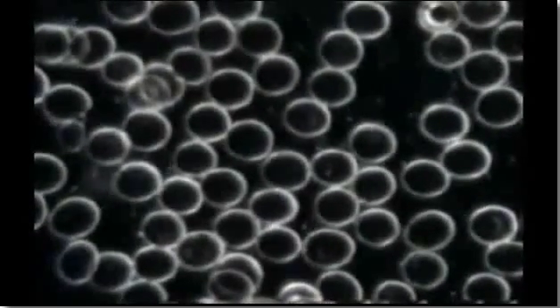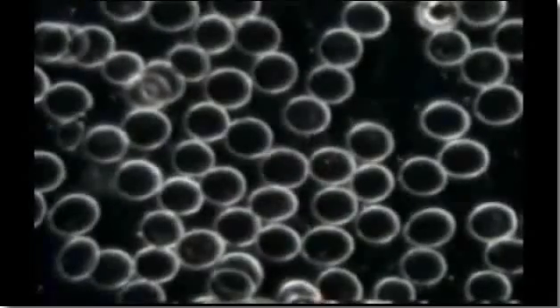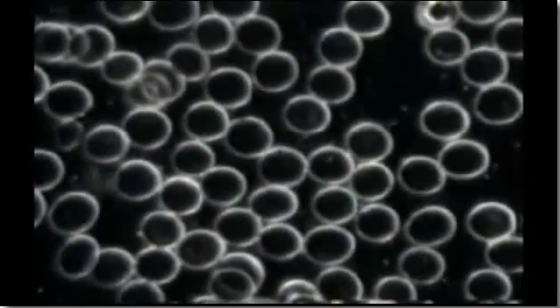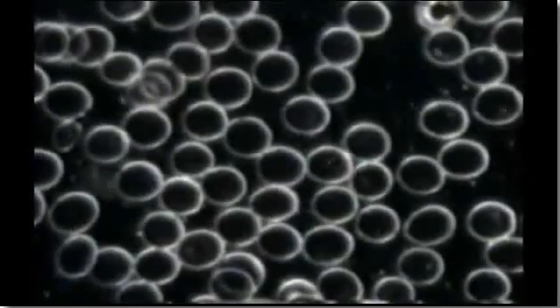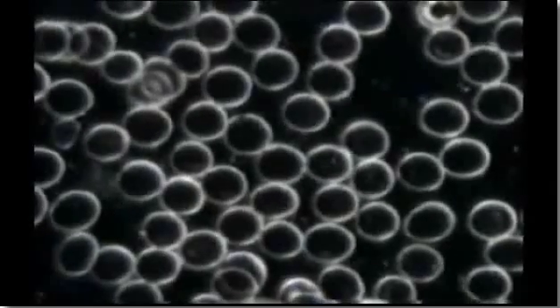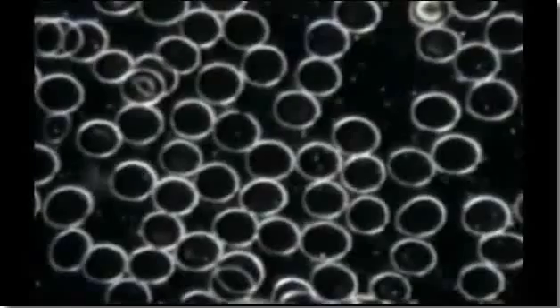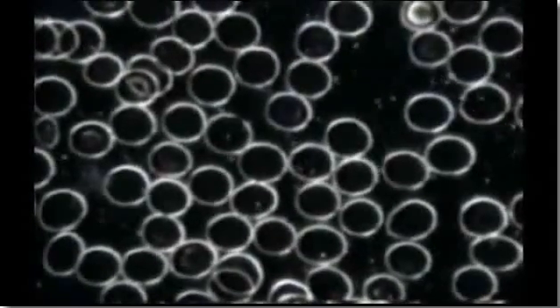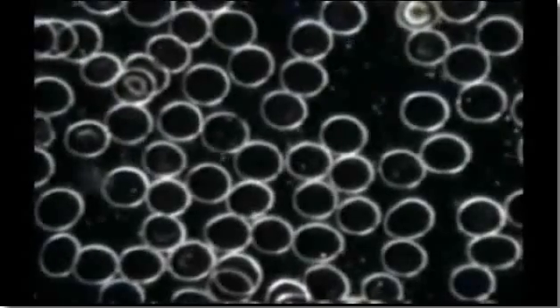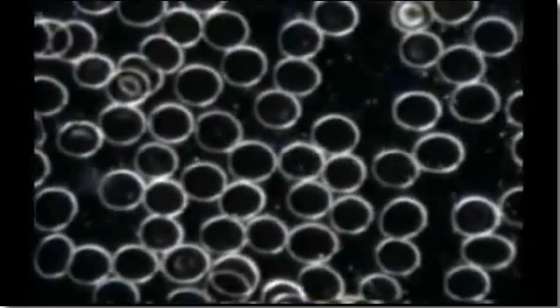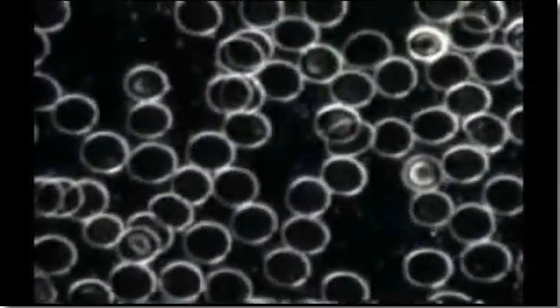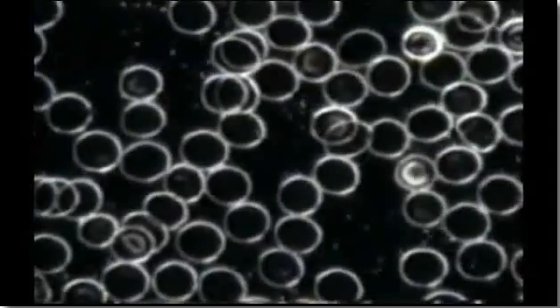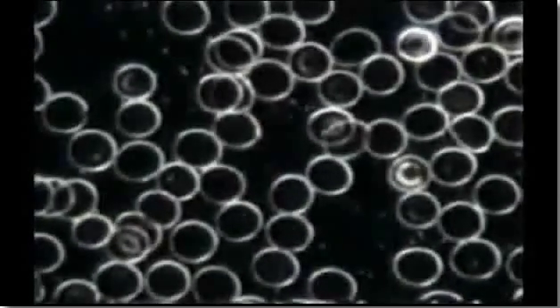You can see that the red blood cells are floating, round and detached from one another. The red blood cells have a lifespan of 120 days. When we see irregular shapes, it is an indication that the red blood cells die prematurely because this person is exposed to some radiation or electromagnetic fields.